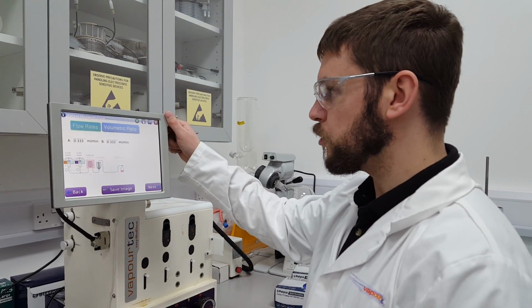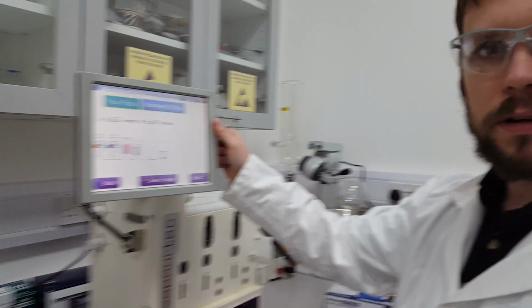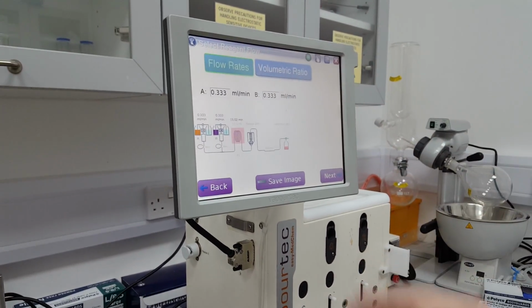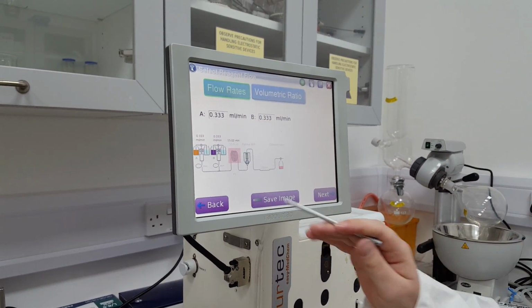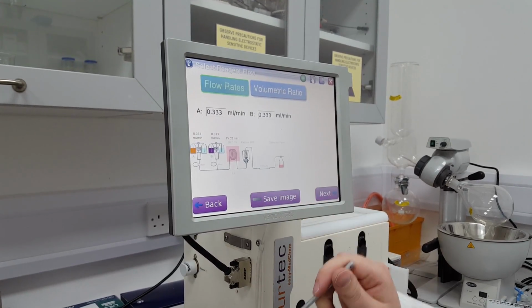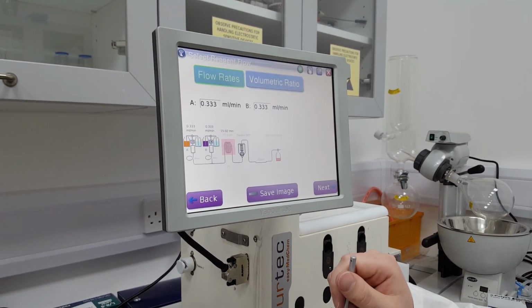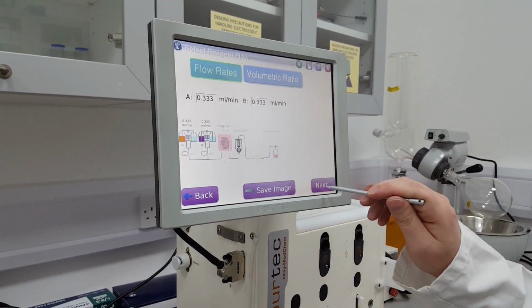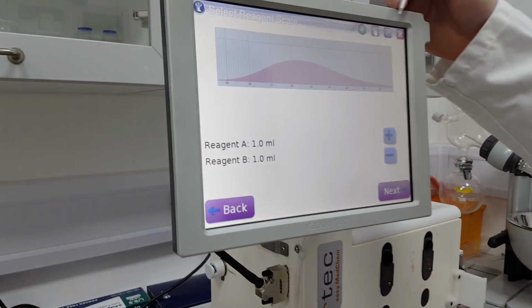So to talk about the dispersion model on the E-Series software, I've gone into FlowWizard and I've set up something that's similar to what you were talking about on your slides. So I've got two pumps, a reactor which is 10 millilitres, 15-minute residence time, and a few other bits. The key thing that I want to show you is the dispersion model.